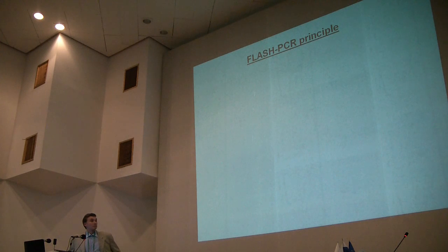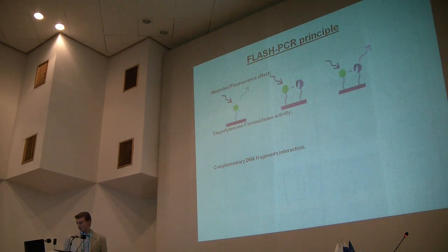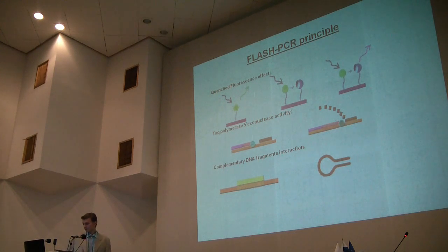FLASH PCR and real-time PCR are based on 3 main principles: quenching fluorescence effect, polymerase exonuclease activity, and complementary interaction between DNA fragments. And here you can see the graphic of these principles.